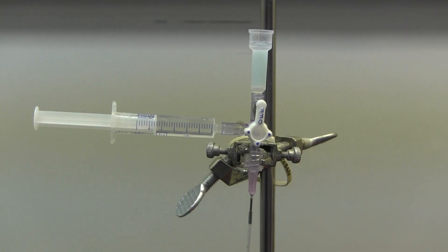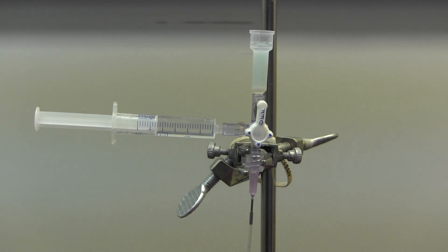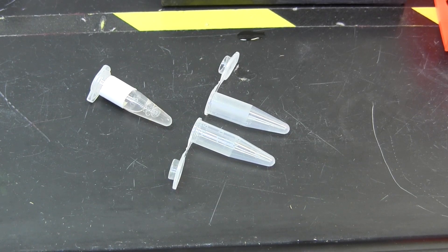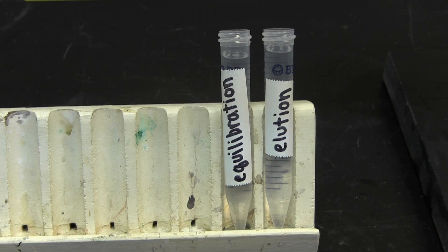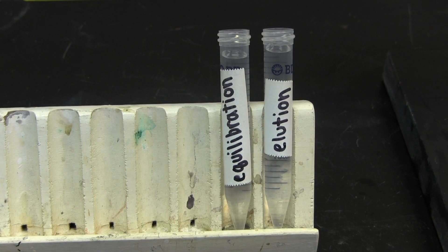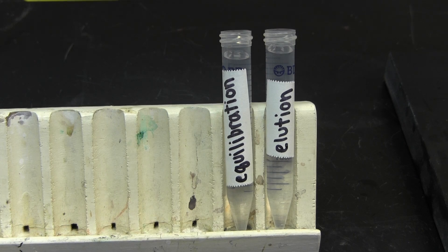Begin by obtaining a packed column that color coordinates with the color of the tape on your unknown sample. This will ensure that your target protein binds tightly to the resin so that the nonspecific contaminant protein can fall through first. Also, obtain 10 milliliters of the appropriate color-coded equilibration buffer and 5 milliliters of the correct elution buffer.